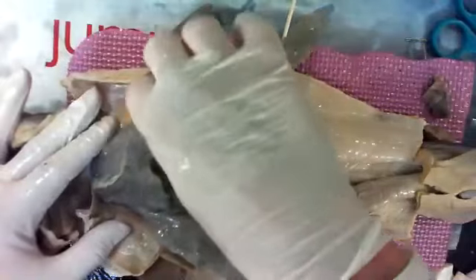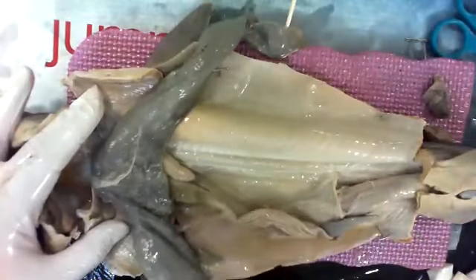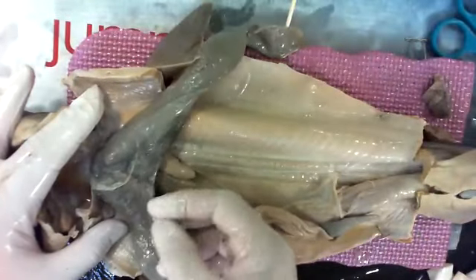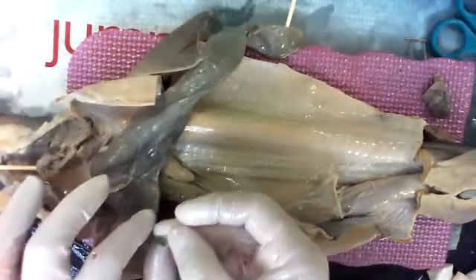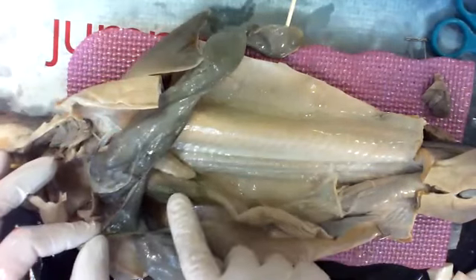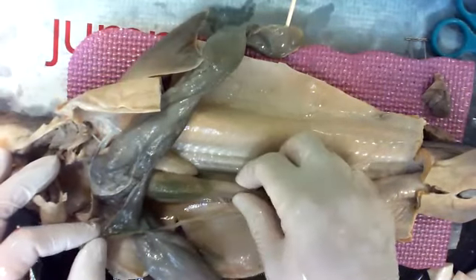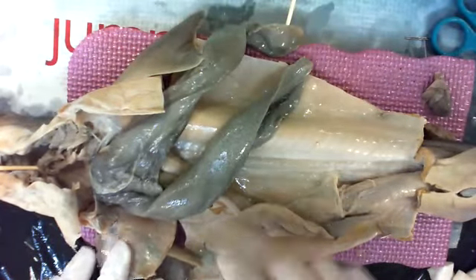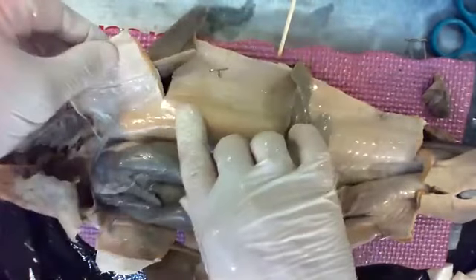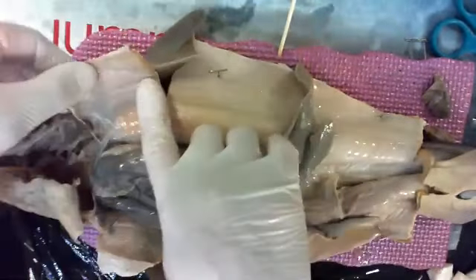We have a little green thing hanging there called the gallbladder. See if you can find the gallbladder. The left lobe, there's a right lobe. There's the gallbladder. It's usually pretty green. In fact, it leaks the green and stains the things around it. So sometimes you'll see, yep, like that, a green line over here on the right side, but no green line on the left side. There's that vessel again, you can see it coming down.